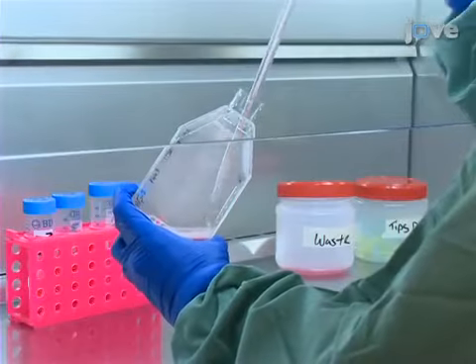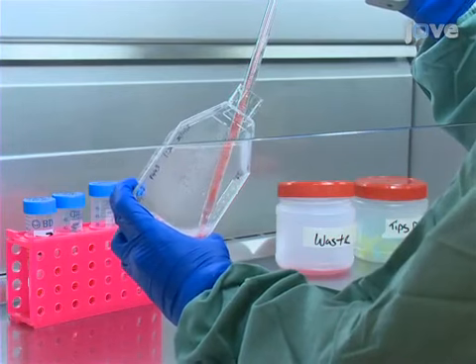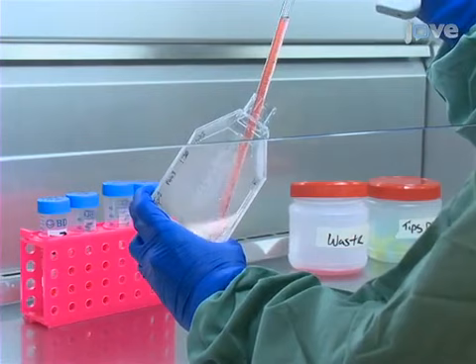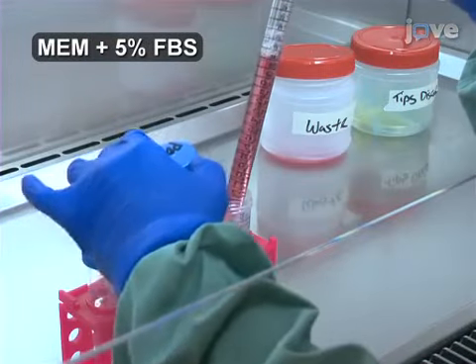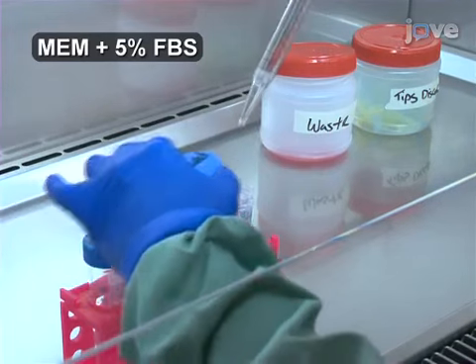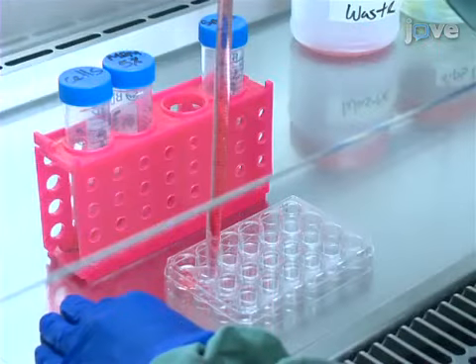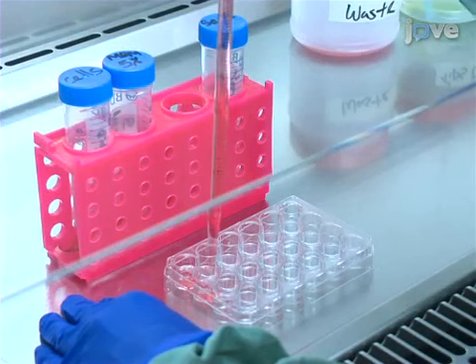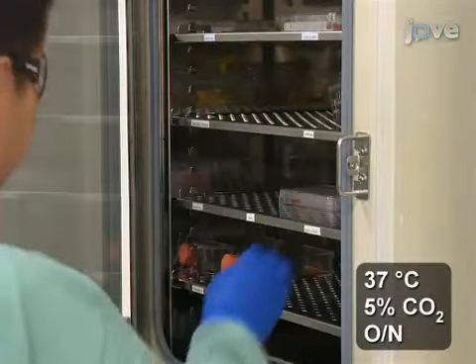On the day before the experiment, split a culture of confluent CCL23 epithelial cells and then dilute them in pre-warmed media to a 150,000 cells per milliliter concentration in a sterile 50 milliliter tube. Next, seed 1 milliliter of the cells per well in a treated 24-well tissue culture plate and incubate the cells overnight.